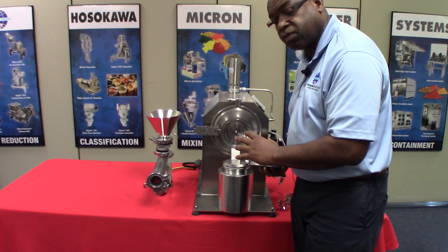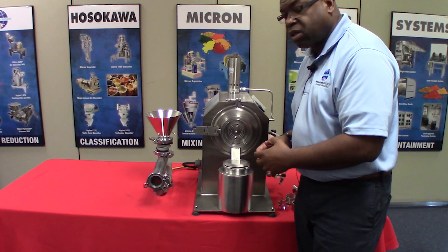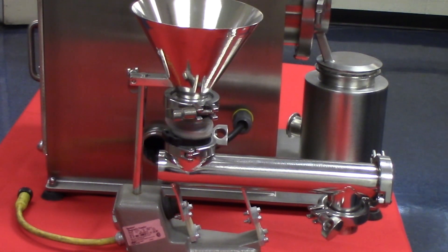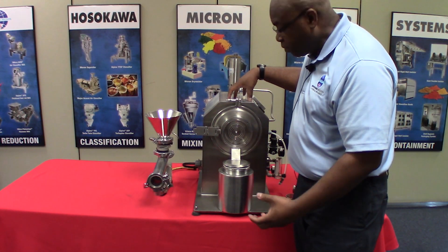These pins do not actually touch. This mill can be run at ambient conditions, and right inside here you have our vibratory — or closed tube vibratory — feeder, which is typically placed on top of the mill to provide a controlled feed into the mill.